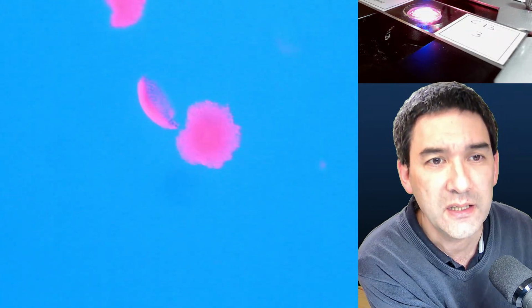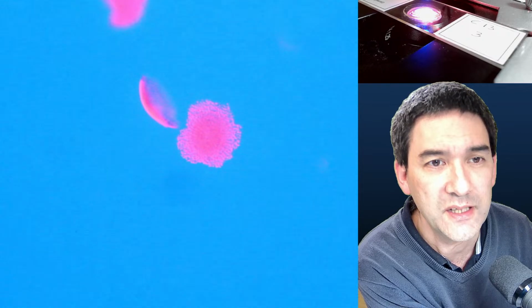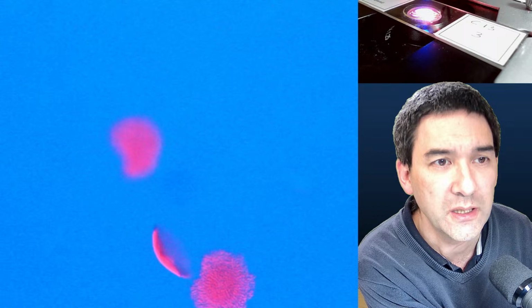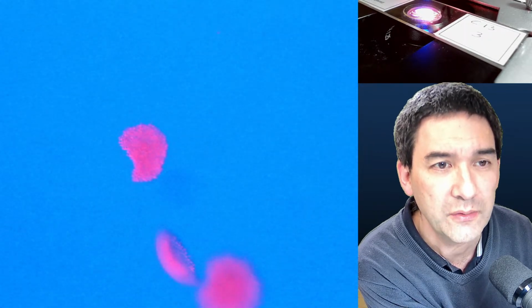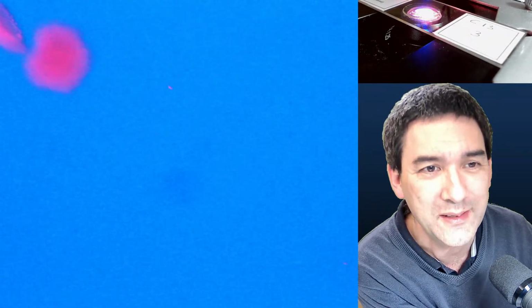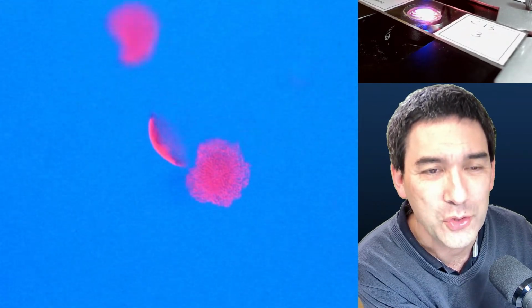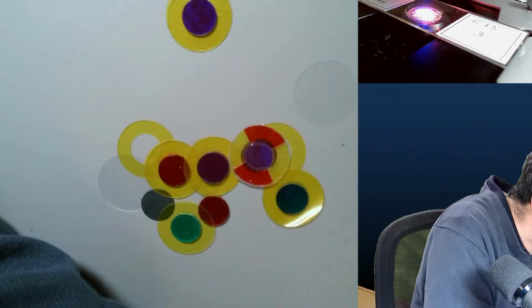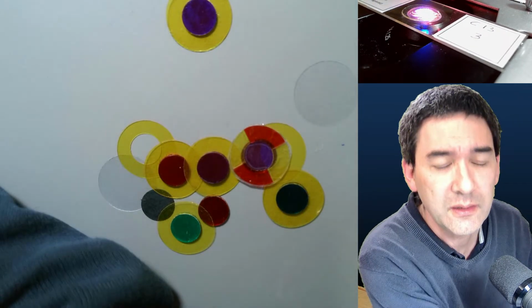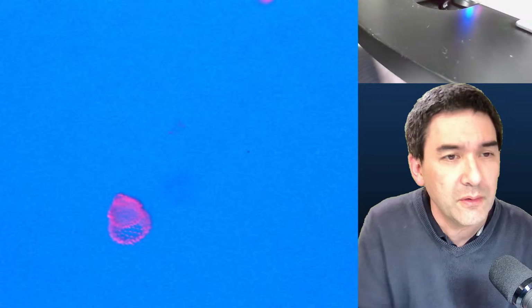Okay, and now you see that the background is blue and the specimen is red. So these are the silica shells of some marine radiolarians. Again, I do admit it looks maybe not quite as crisp, but under the microscope it does look much better than what we have here. Let me check the microscope directly. Here, this one for example.